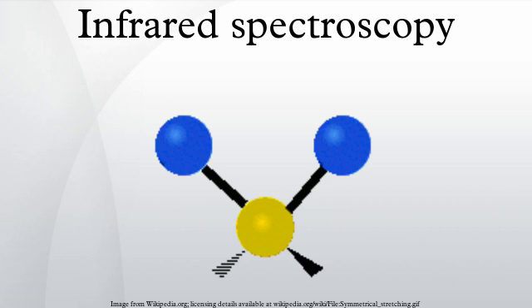Practical IR spectroscopy. The infrared spectrum of a sample is recorded by passing a beam of infrared light through the sample. When the frequency of the IR is the same as the vibrational frequency of a bond, absorption occurs. Examination of the transmitted light reveals how much energy was absorbed at each frequency. This can be achieved by scanning the wavelength range using a monochromator. Alternatively, the whole wavelength range is measured at once using a Fourier transform instrument, and then a transmittance or absorbance spectrum is generated using a dedicated procedure.